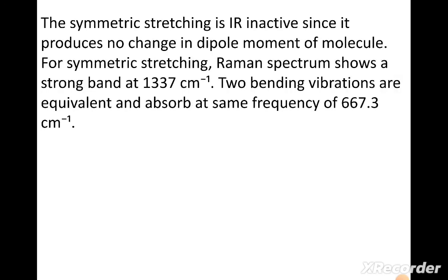The symmetric stretching is IR inactive since it produces no change in the dipole moment of the molecule. For symmetric stretching, the Raman spectrum shows a strong band at 1337 cm inverse. Two bending vibrations are equivalent and absorb at the same frequency of 667.3 cm inverse.